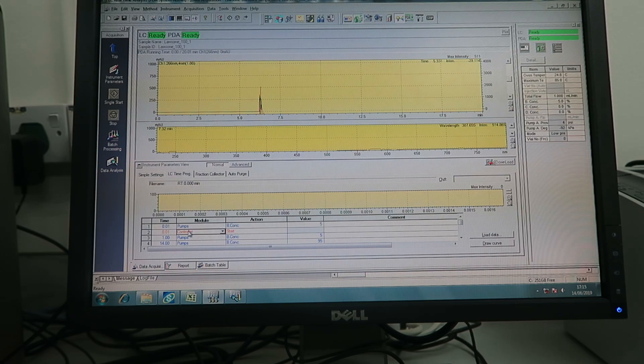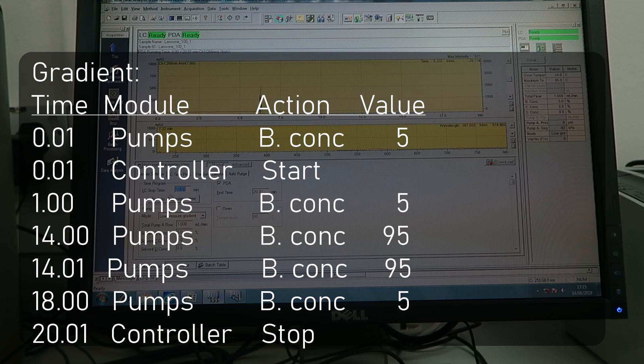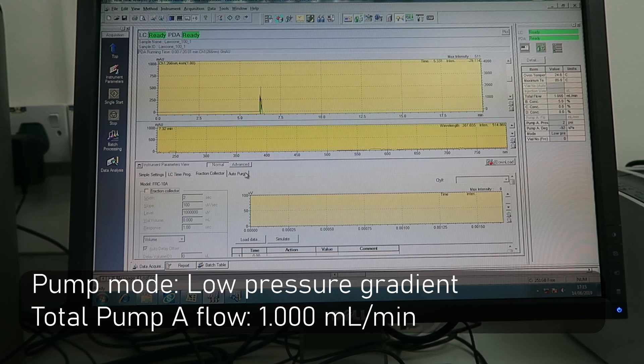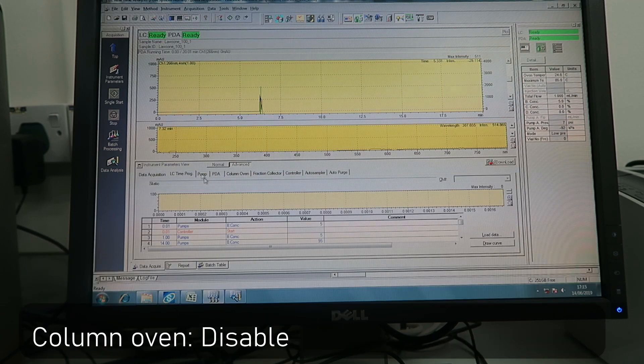For the gradient, you have to set how many percent of the pump is mobile phase A and how many percent is mobile phase B. This is an example. For pump mode, you can choose Low Pressure Gradient, BDLM, or isocratic.